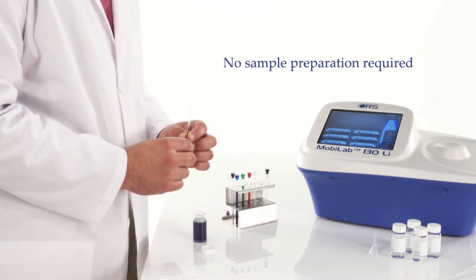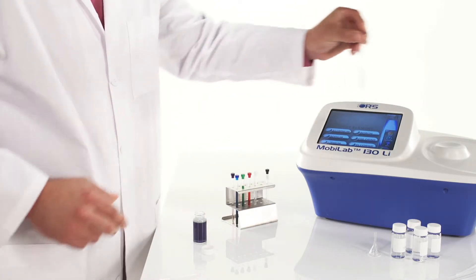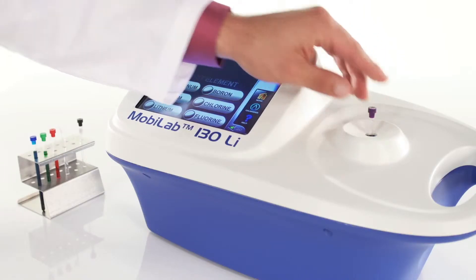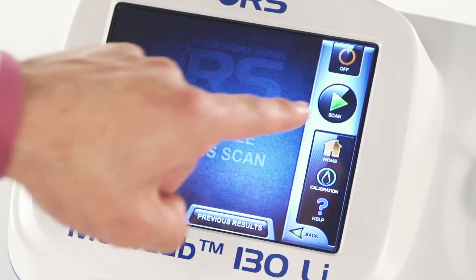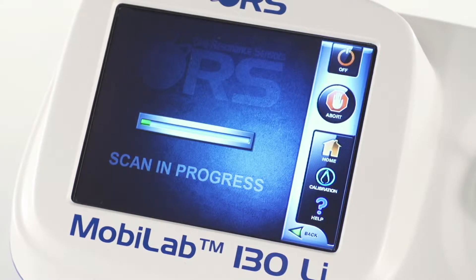No sample preparation is required. Fill a tube with your liquid sample. Insert the tube into the sample holder, sliding it down until it reaches the stopper. Press the scan button on the touch screen. The scan will now take less than one minute.